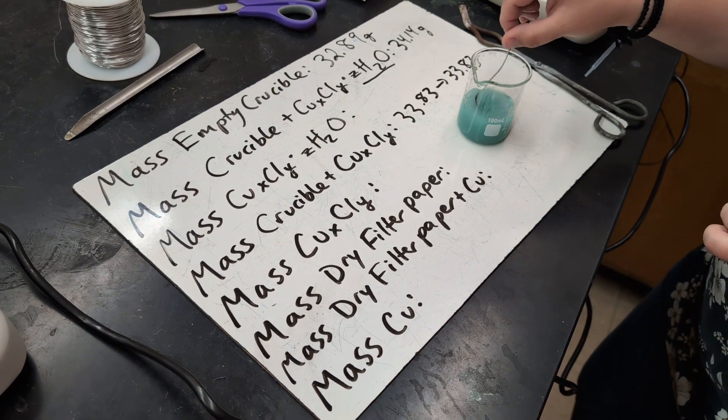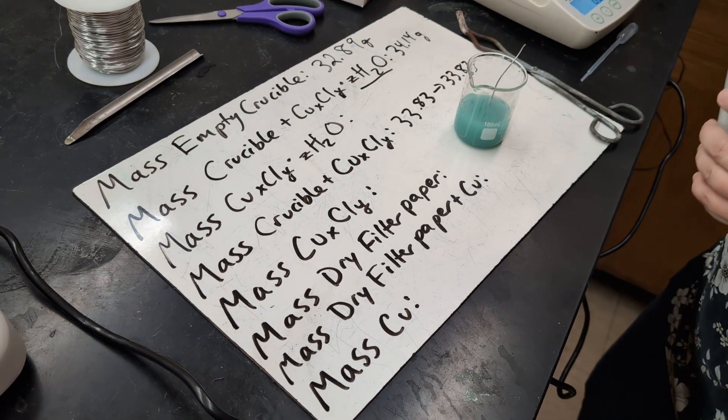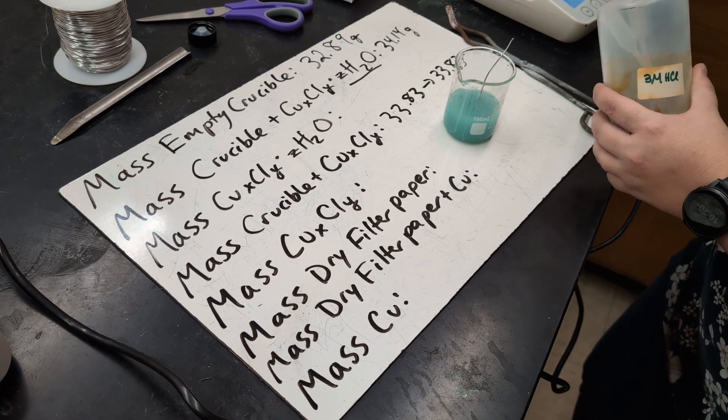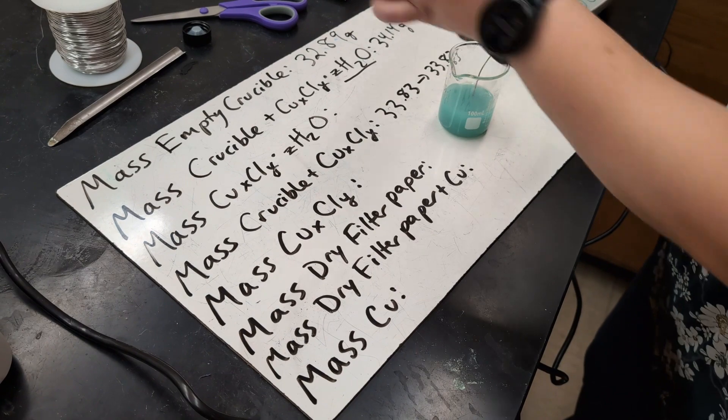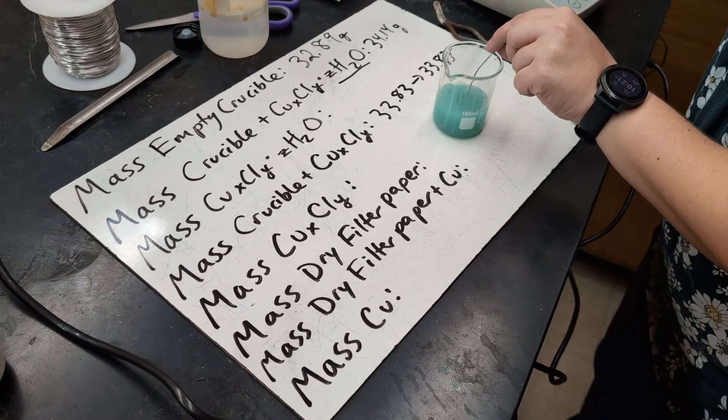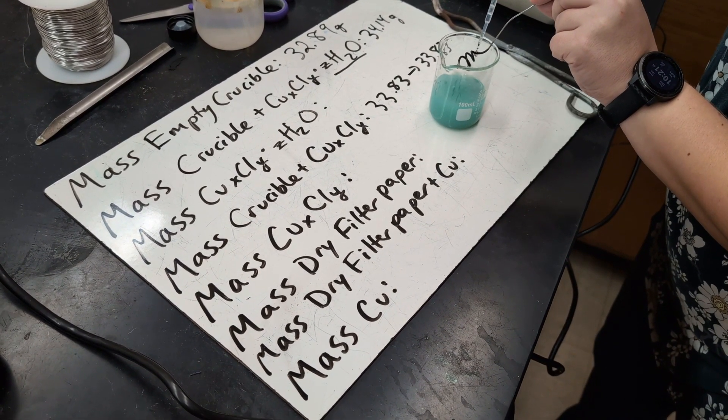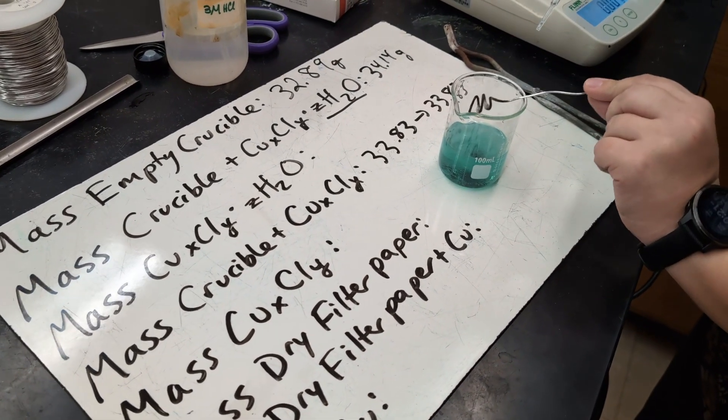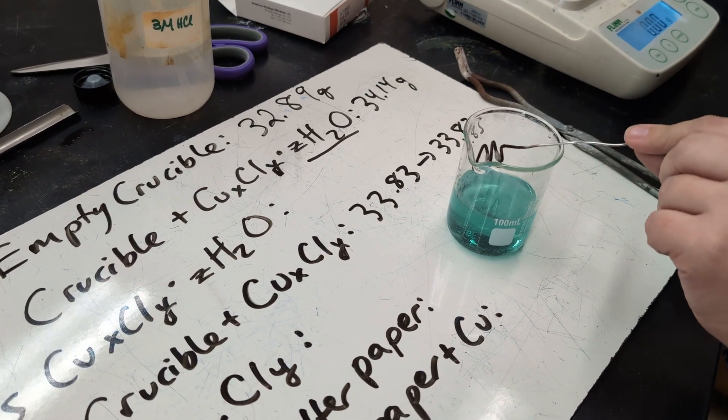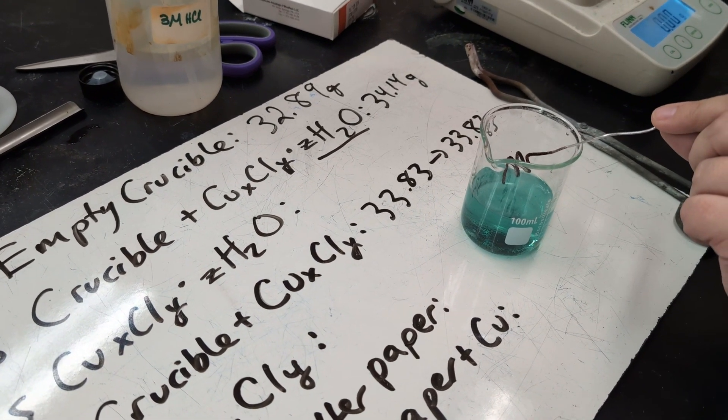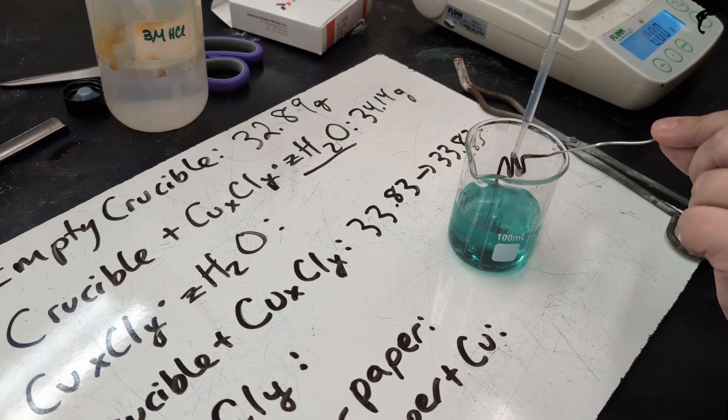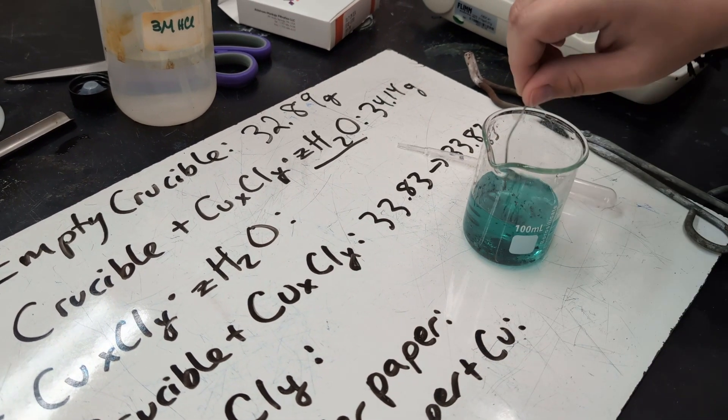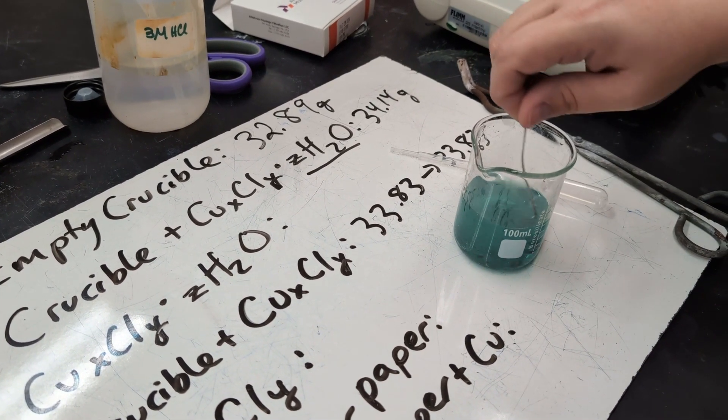And to speed it up a little bit, by making sure that we have enough surface area of aluminum, you can add a little bit of hydrochloric acid on the surface of the aluminum wire. That's going to get just the copper to leave and expose the aluminum. You see the bubbles? Use just a little more. And then you can keep stirring and keep doing it again. Keep going until all of the copper is gone.